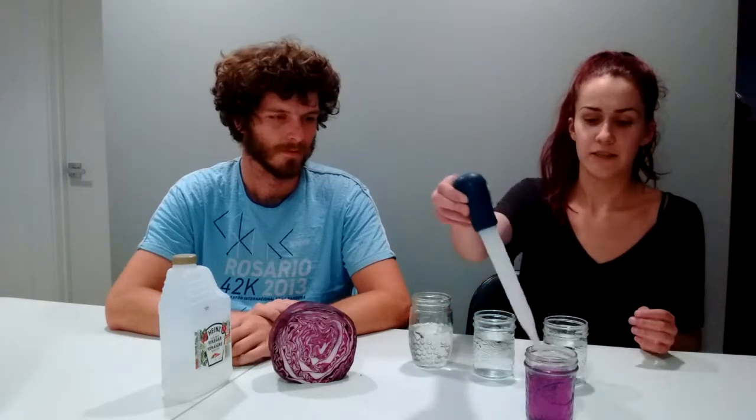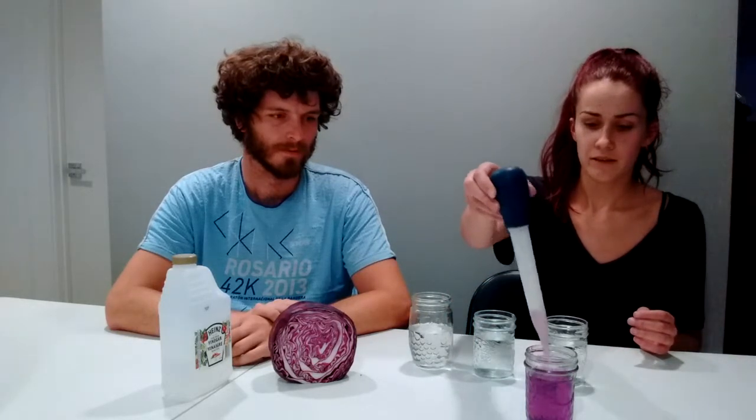And this as an indicator is really good because in base it will turn blue and in acid it will turn pink. So that's another fun point too, if the kids are more advanced, then you can use this to explain a little bit more about acids and bases, depending on how much time you have in the workshop. But that can be fun too. So we'll take a bit of the indicator.